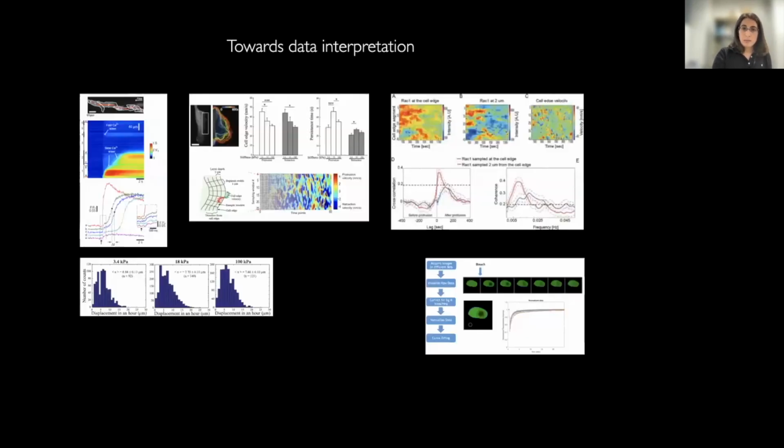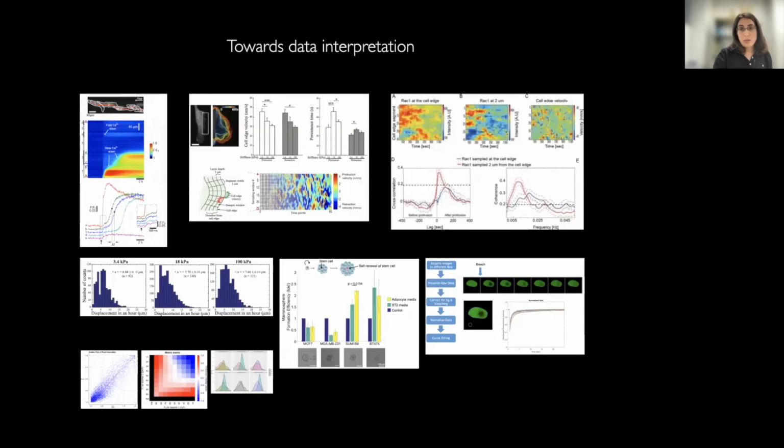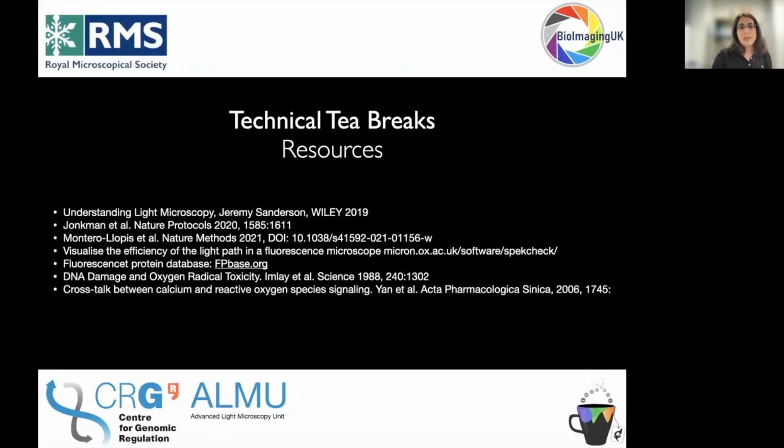Once you're done imaging and have acquired all your data, you've probably already thought of data management and storage. You want to process, analyze, and interpret your results. This is key for live cell imaging because otherwise you wouldn't be able to answer key biological questions. With that, I would like to leave you with some resources, and I hope you enjoyed the technical tea breaks.